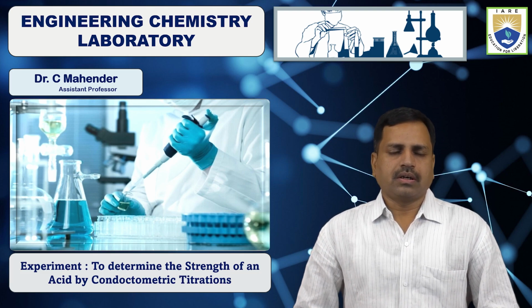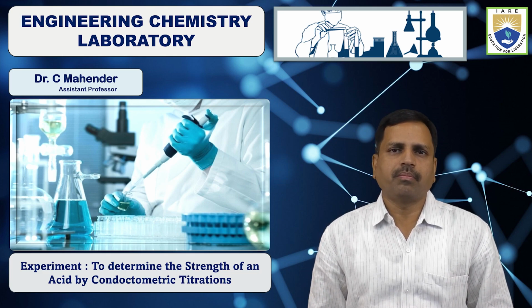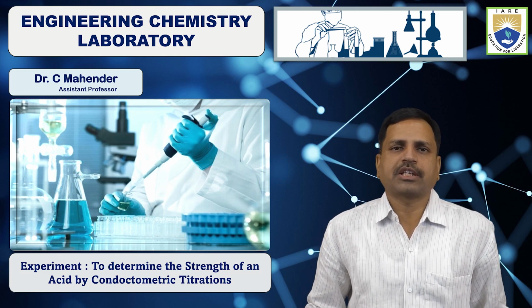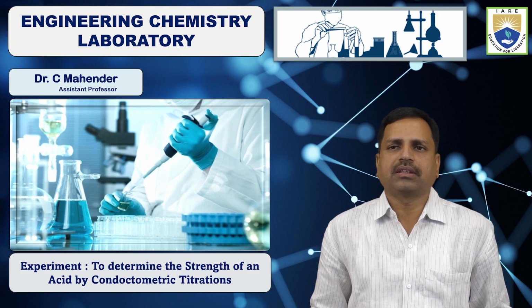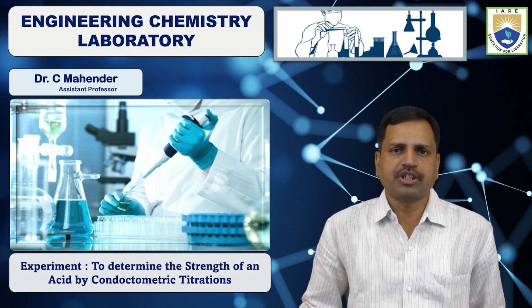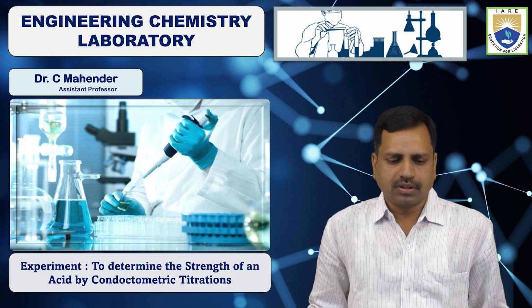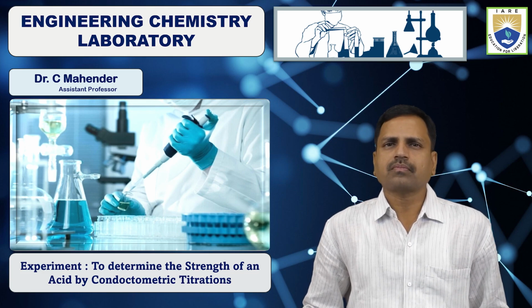So today my topic is to determine the strength of an acid by conductometric titrations. This is an experimental lab, and first I will explain the aim of the experiment, the principle and the procedure. This is for engineering first year, which will have the conductivity experiment.